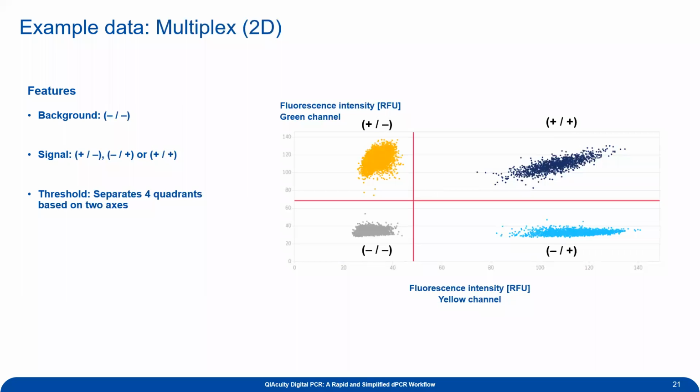So are you saying, can you do more than one target per well? Well, your number of master mixes depends on how many targets you want to detect per well. If you want to do, let's say, 3 targets per well, you would combine your dPCR mix with your corresponding primers plus probes into one master mix. Then you would pipette that across your wells and add your different samples. If you were doing 5 targets, it would be the same idea, but you're just adding in those additional 2 target primers and probes.